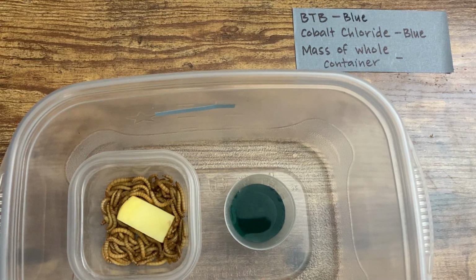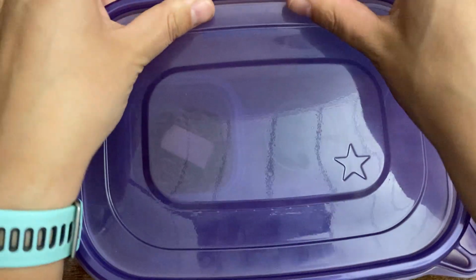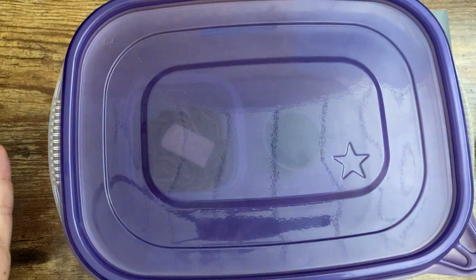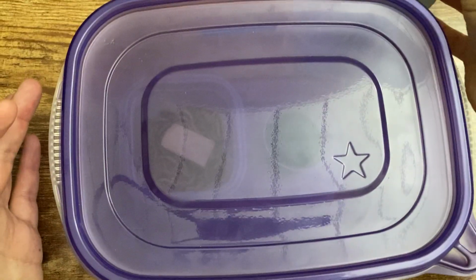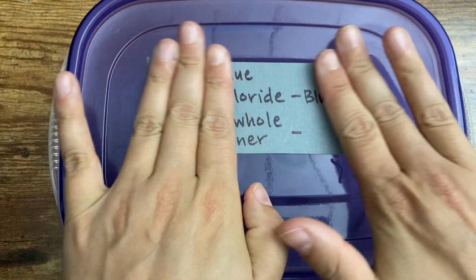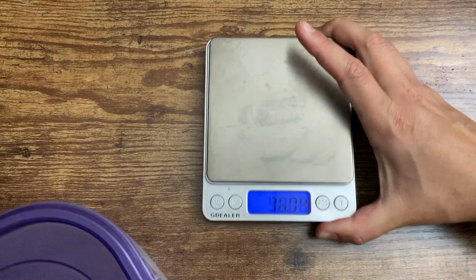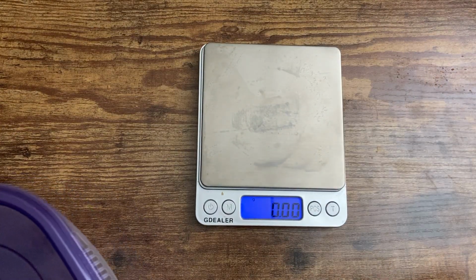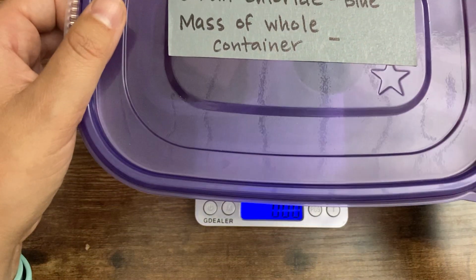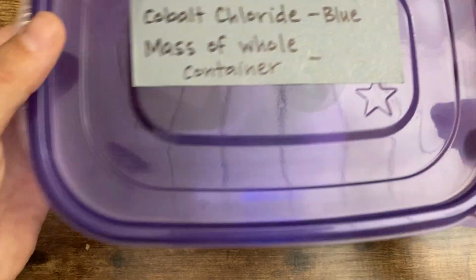All right, now that we have that, it's time to seal the container, and I'm wanting to press on all sides so that now that is a completely sealed container. I'm gonna put the rest of my data here on the top, and now I'm gonna find the mass of this whole sealed container. So I'm gonna bring my balance back over, make sure that it's reading 0, place the whole container on top, and the mass of the whole container is 96.95 grams.